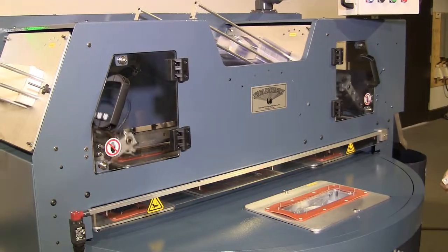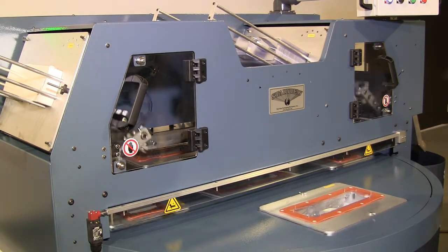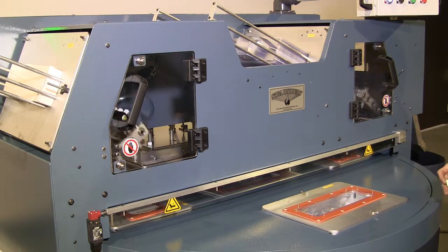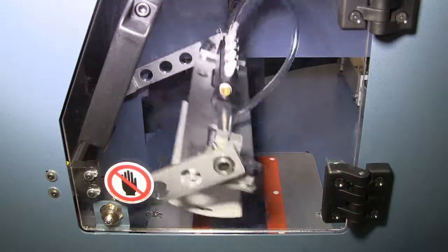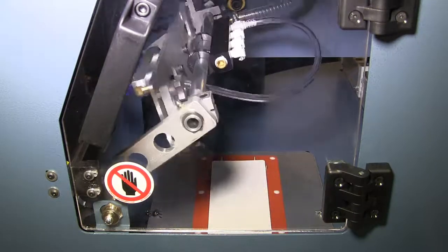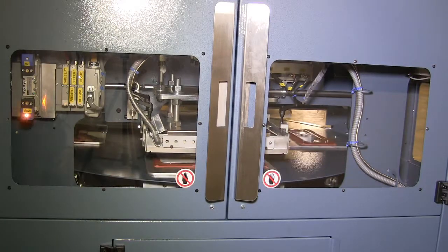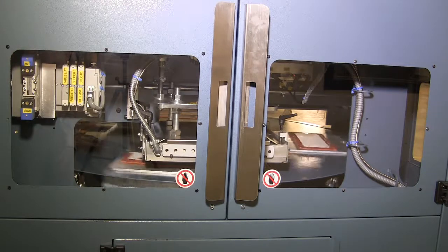The FAB4 series automated rotary blister sealing machines are built with the capability to feed blisters, blister cards, and discharge finished packages when proper tooling is installed. An electrically driven automatic blister feeder, card feeder, and finished package unloader greatly reduce the machine air consumption and at the same time increase the operating speed of the machine.